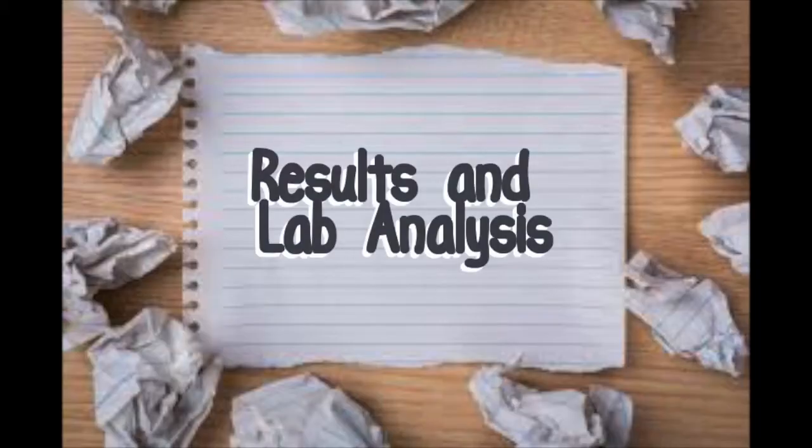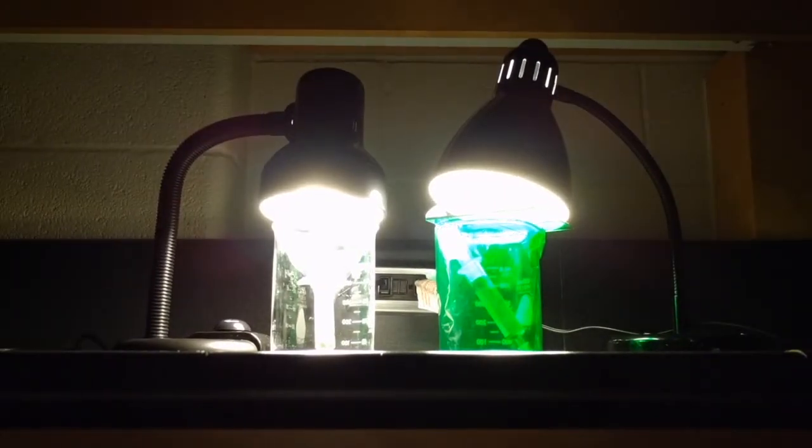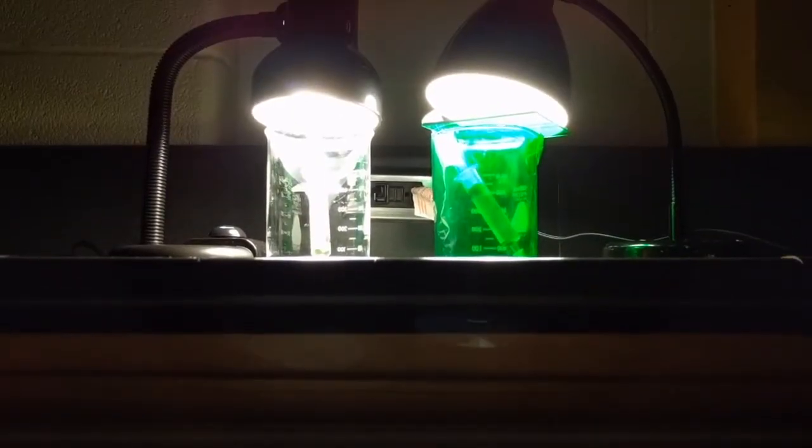Results and lab analysis. Our results consisted of 7 of the 10 discs in the white light beaker floating to the top of the syringe within 50 minutes. The first 5 rose to the top within the first 20 minutes, and the last 2 rose up near the 50-minute mark. In the green beaker, no discs rose to the top within 50 minutes.